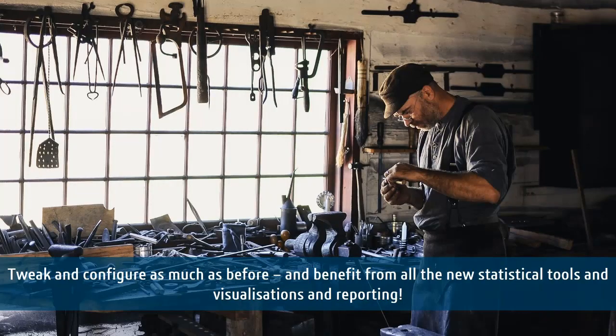Yeah, that actually brings me to the next point. Not only about how you can change your report, but you also mentioned analysis that your team has been including, new method analytics, previous ones that were available for a long time. But what if I want to bring my own way of looking at data because my assay is different, it's special, or I just want to add some new cutting edge analytics in the system that has not yet been implemented in Assay?